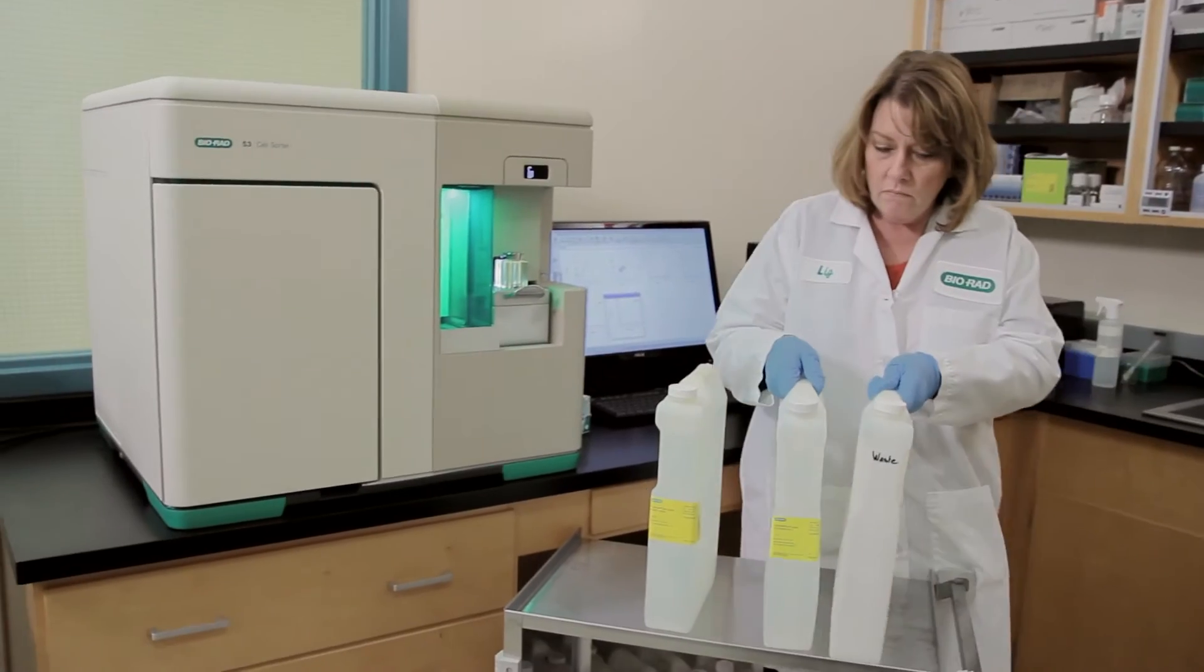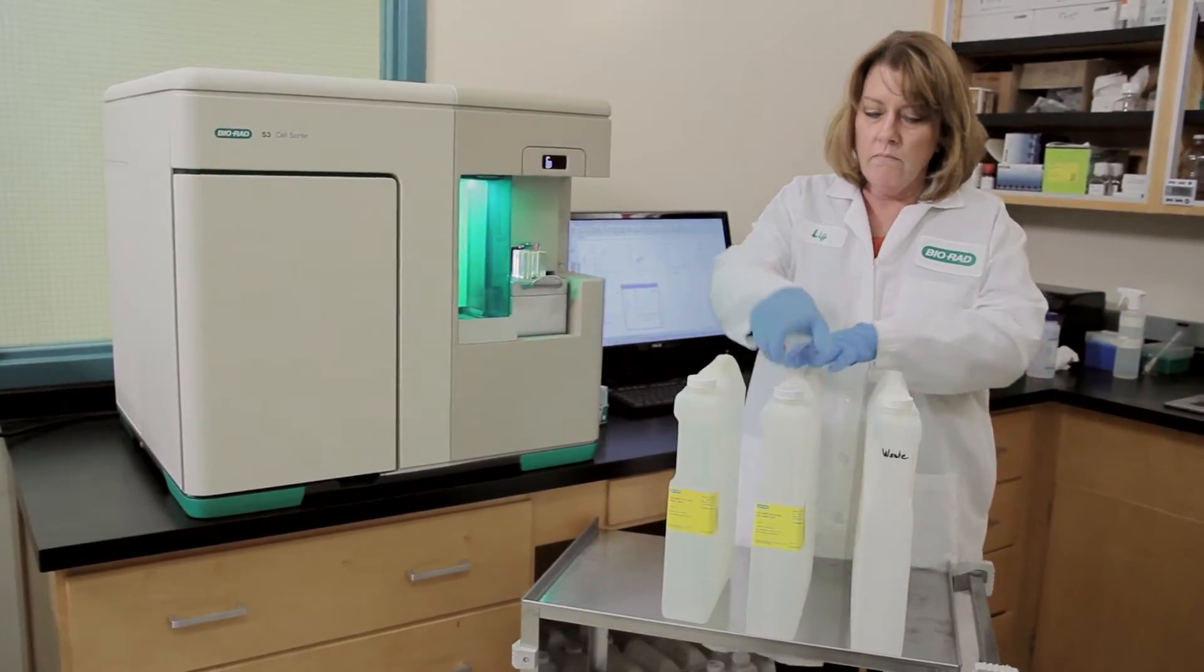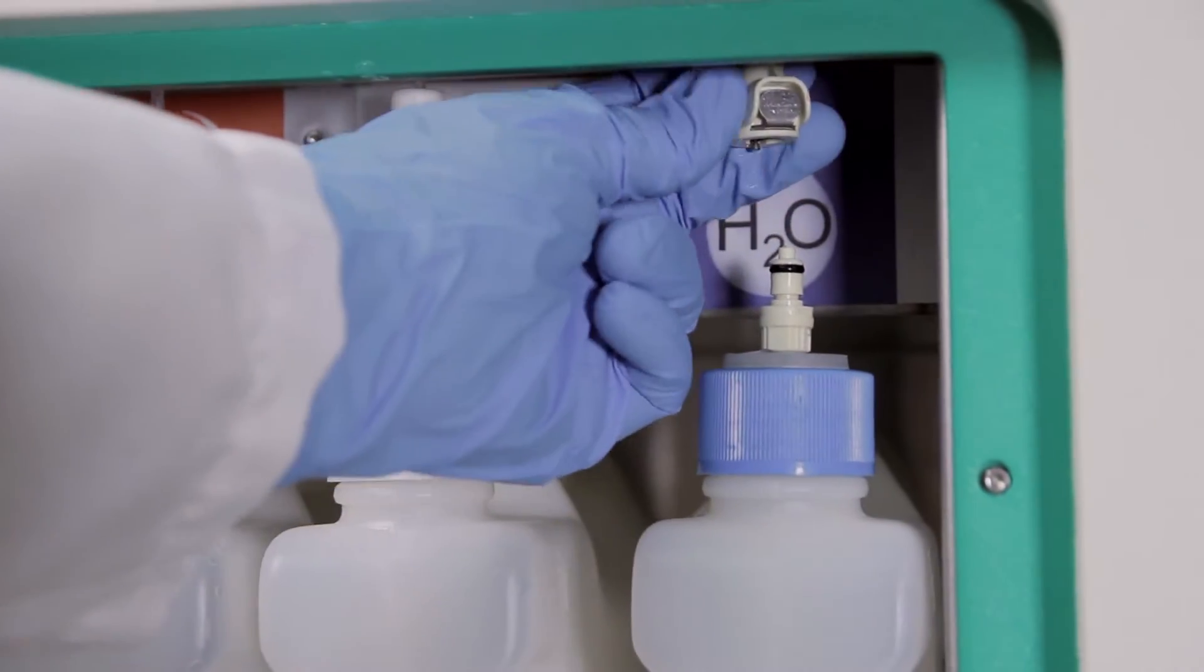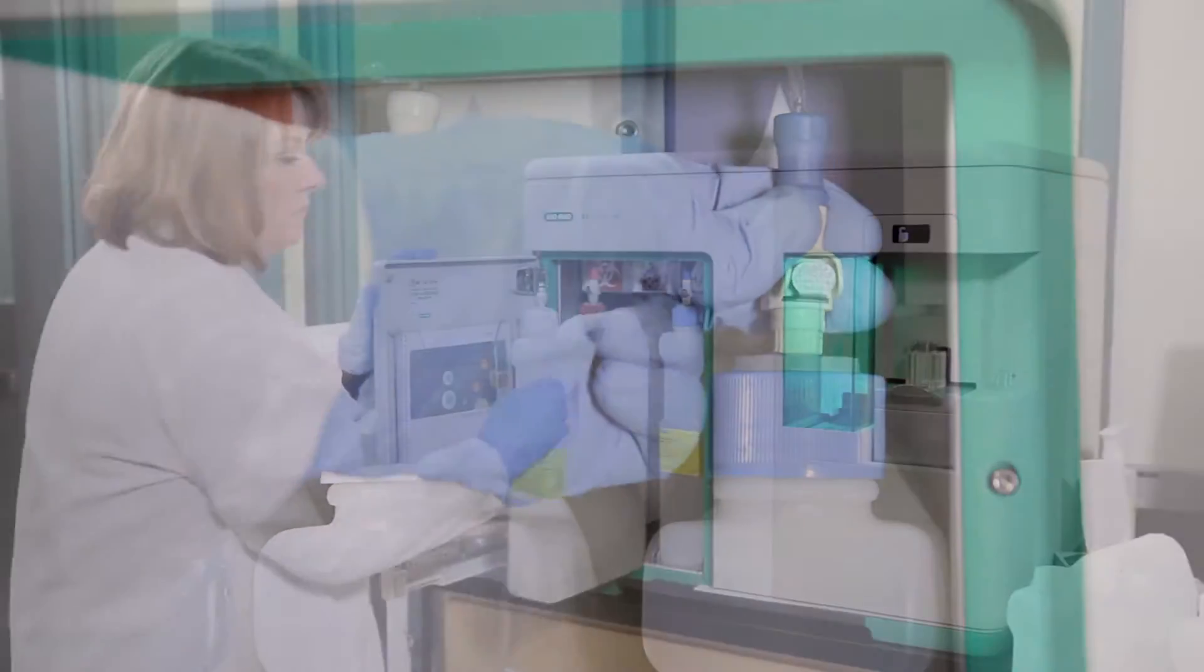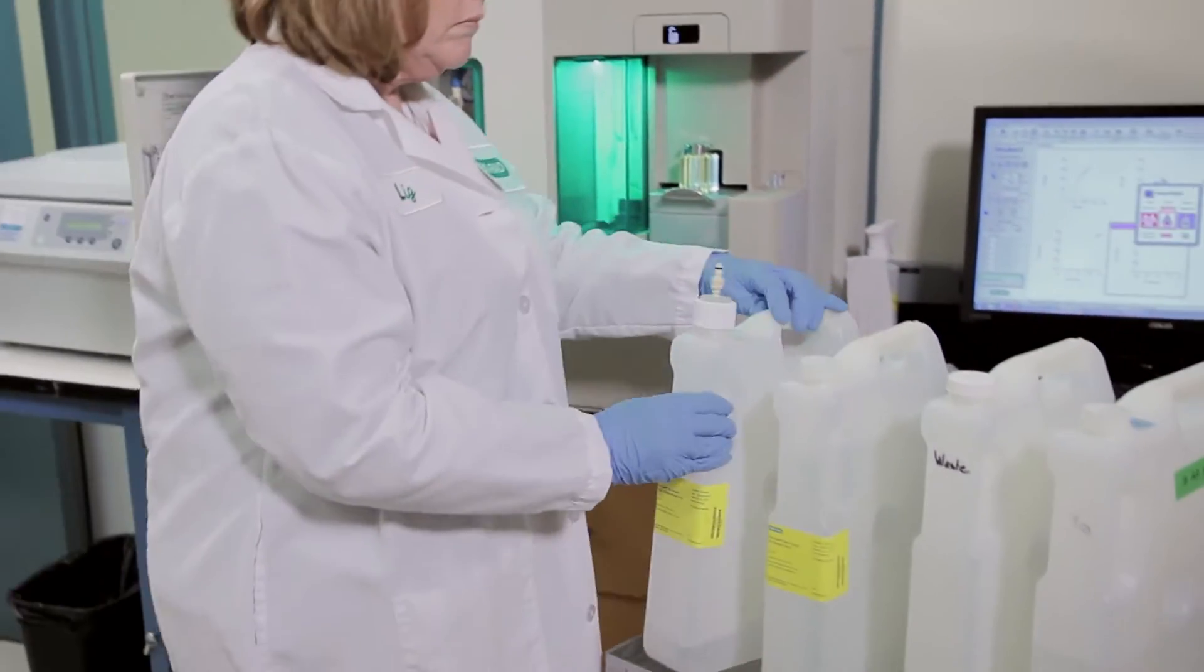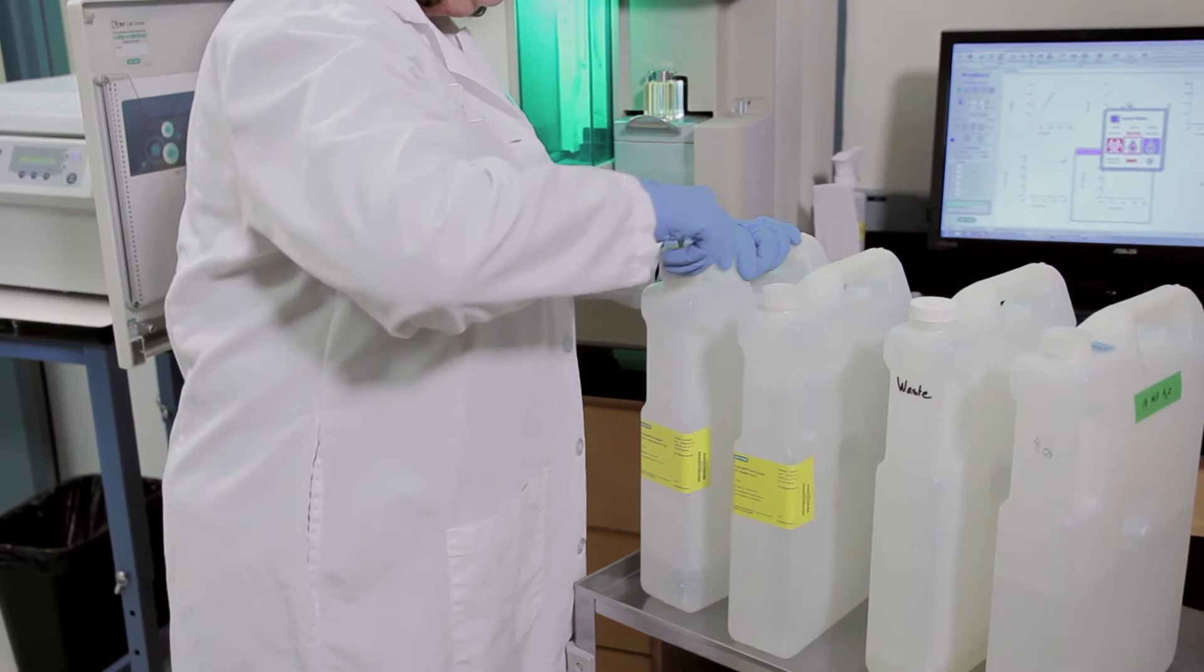A hot swap on the S3E cell sorter allows you to exchange fluidics bottles without needing to shut down the instrument and can be done with the DI water, sheath and waste bottles. A hot swap is possible because the S3E cell sorter contains an internal sheath reservoir which maintains the system pressure while the fluid bottles are being exchanged.